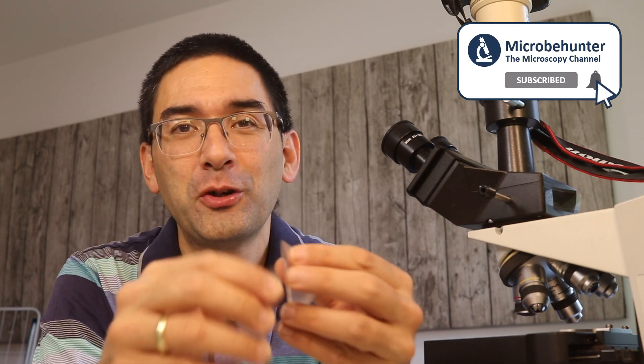And so all the binoculars, if you bump your binocular against an object, it can be that these parts, the prisms, they slip a little bit and then you cannot get a proper picture anymore and you see two different images.